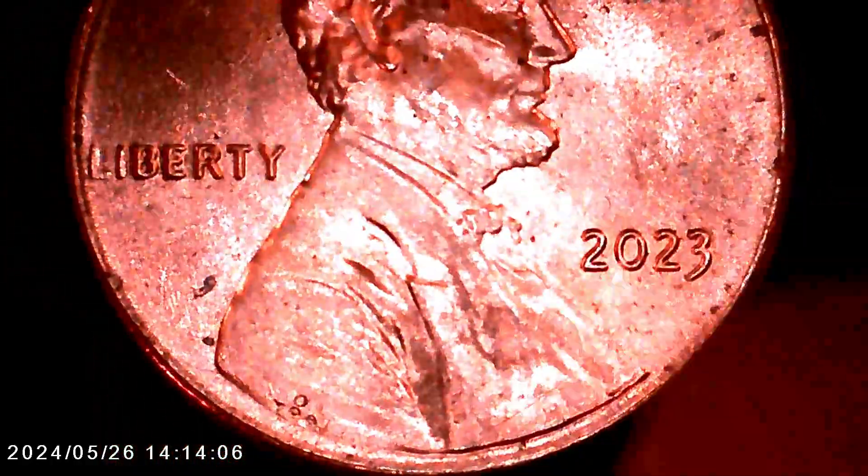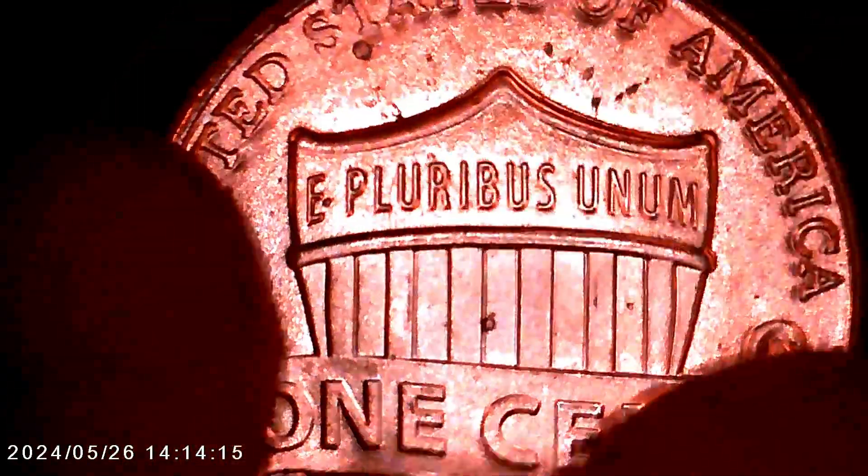And you can see it there. It looked nice and shiny to me but apparently it's dirty. Didn't look that way in real life. Flipping that around we can see the back there. And of course the inscriptions.